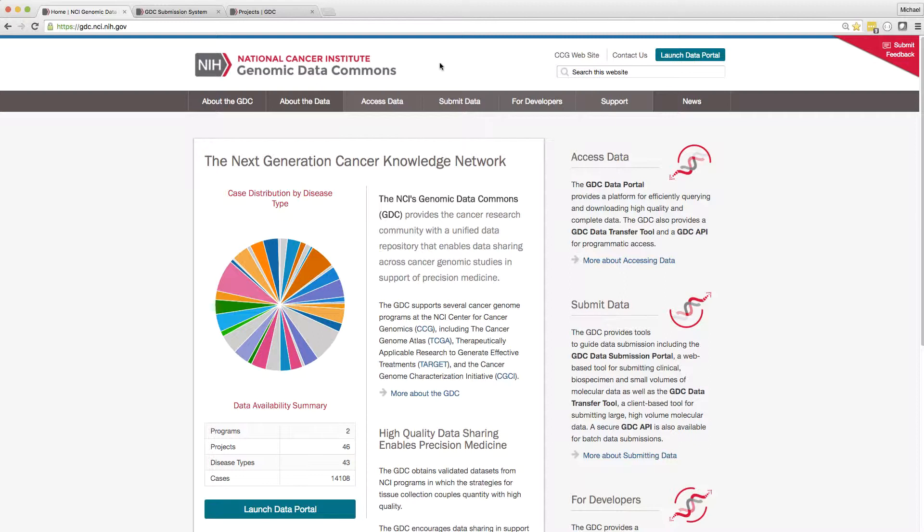The Data Transfer Tool, or DTT, is a command-line based utility that allows users to upload or download large molecular data files to the GDC.